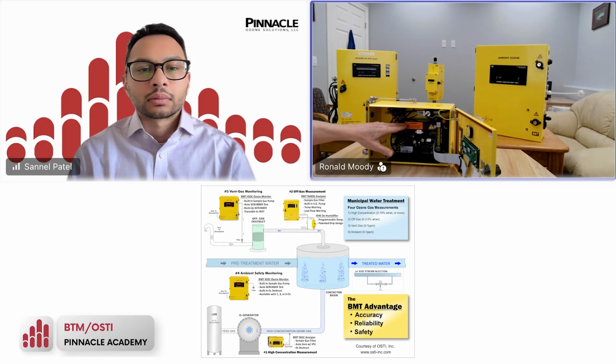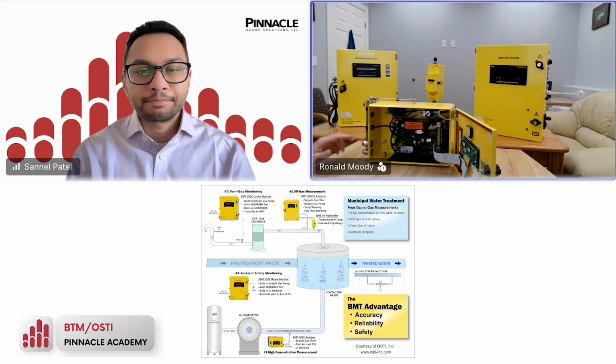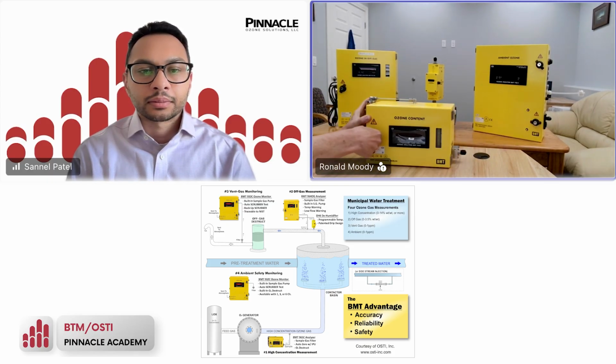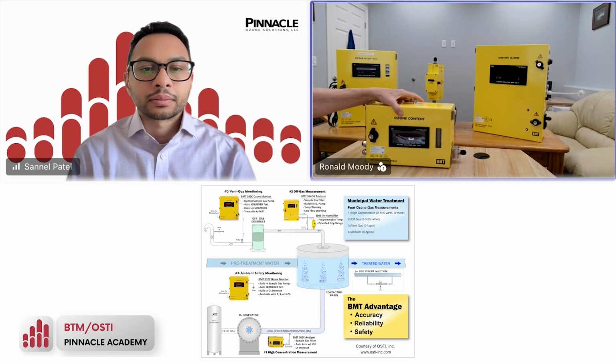It is sampled through the cuvette. And here's a picture of the cuvette block, okay? And then it comes out and is destroyed, okay? This happens to be an industrial cabinet, NEMA 4X enclosure, weatherproof, and so it has its own zeroing and purging functions. Zeroing is important for an analyzer to keep track of what's happening in the environment, especially environmental drift in the cuvette over time.